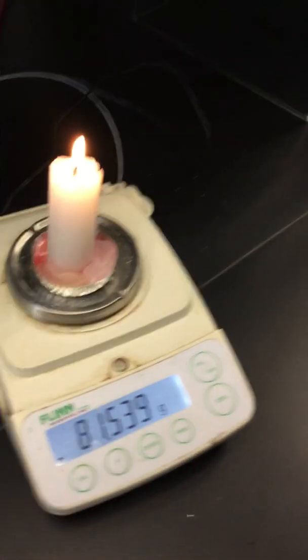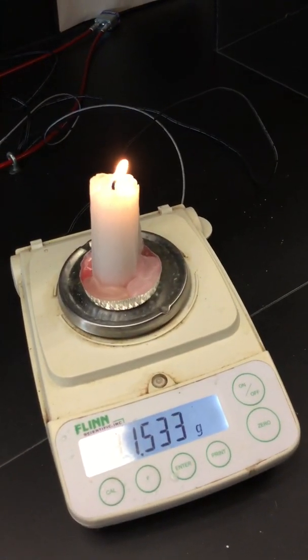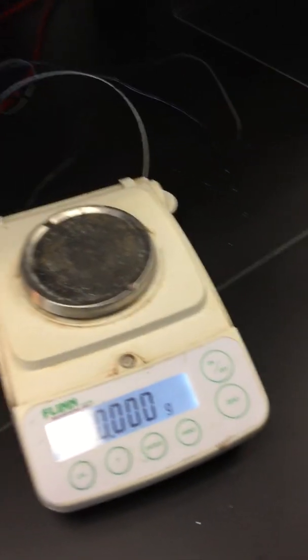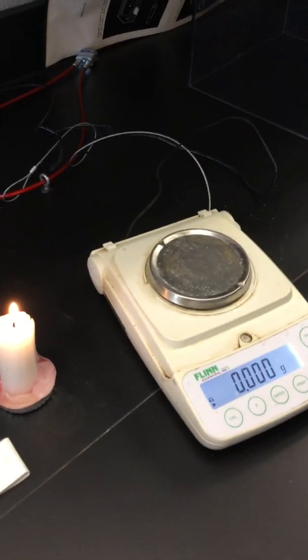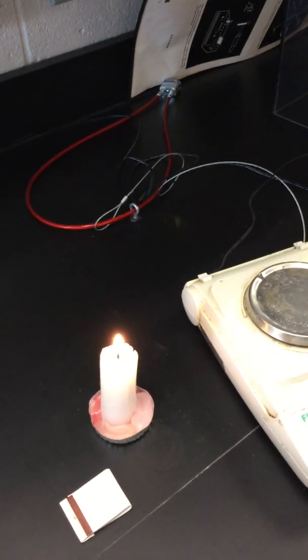Let's find our way back to station 9 where our candle has been burning. If I look at it, let's cut the timer right now, our candle now has a mass of 81.533 grams. That mass that's leaving is wax burning away. We're doing combustion, so we've got a hydrocarbon turning into carbon dioxide and water.